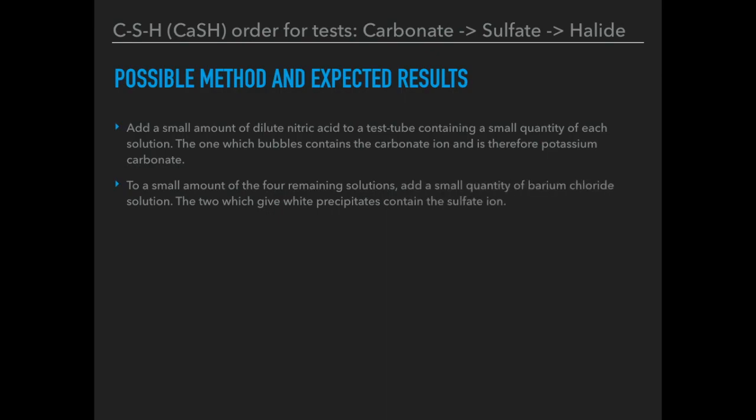With four remaining solutions, we add a small quantity of barium chloride solution to each. Two of them are sulphates, so we should expect to see two white precipitates. At that point, we can't say which is which, because one is ammonium sulphate and the other is a metal sulphate.